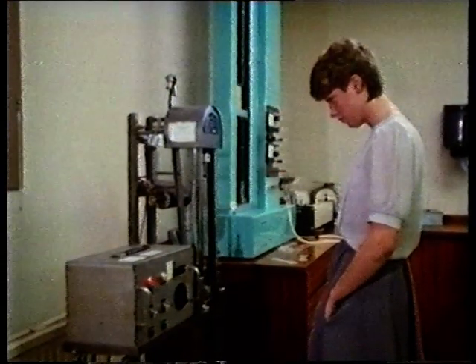Tests of this kind are very important to people making things out of the plastic. It's still stretching. Remember, this has to do with the way in which the carbon chains are arranged in the sheet. In a direction at right angles to that in the first test, a specimen from the same polyethene sheet behaves quite differently.